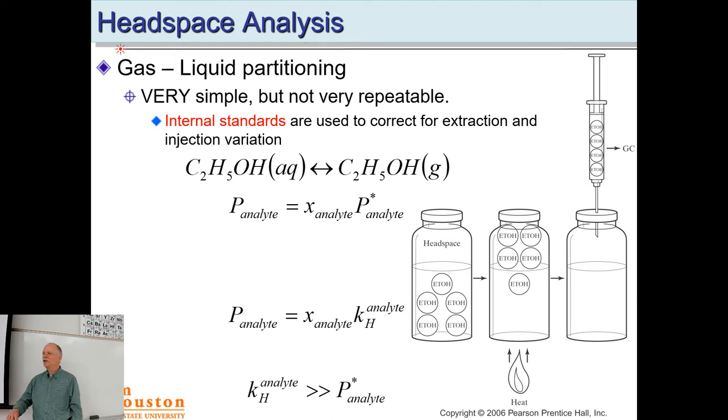And so it was always going to zero, and the student would turn it up as long as they could smell something. And then when they couldn't smell it anymore, they let go, and the computer would turn the knob back to zero, the signal back to zero. And so you'd get a peak. When the student smelled something, they'd turn that knob, and that was your peak. They quit turning the knob, and the computer would turn that knob back down. And so you would get a chromatograph, and the student's nose was the detector.